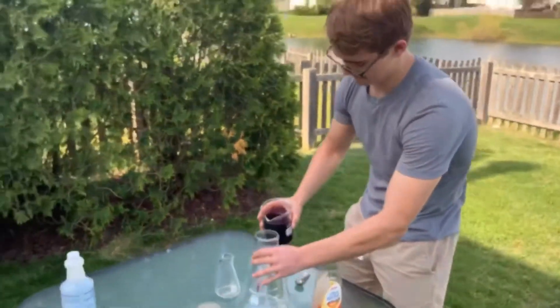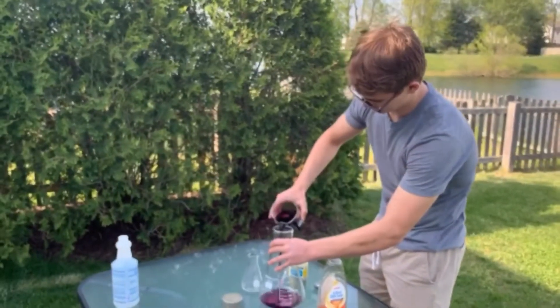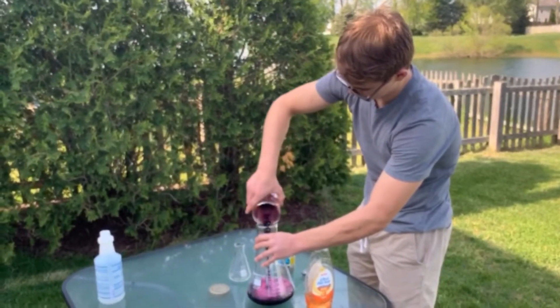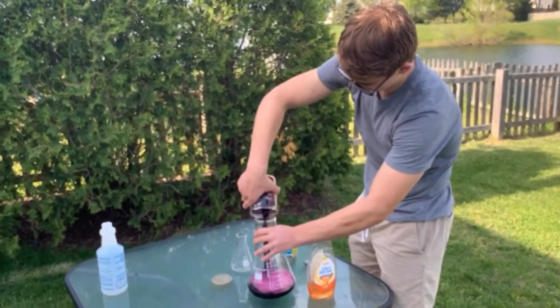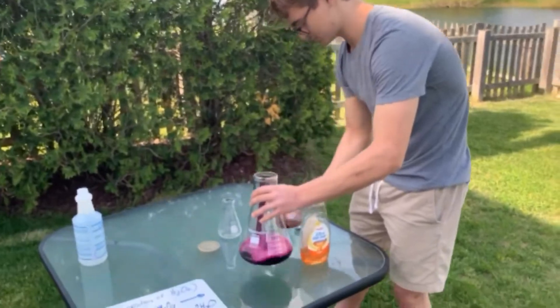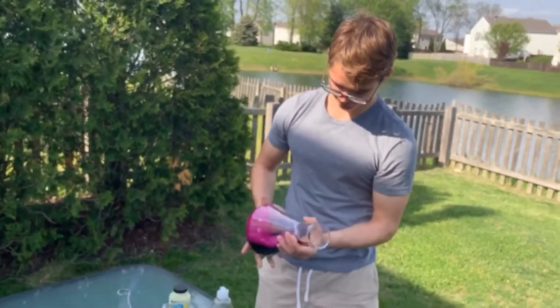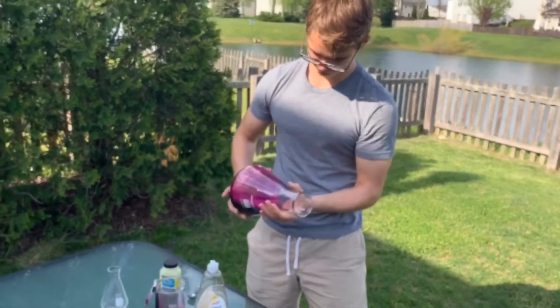Go ahead and pour that in. Then tilt that and let it coat the walls of the flask, so it gets all over the walls of the flask.